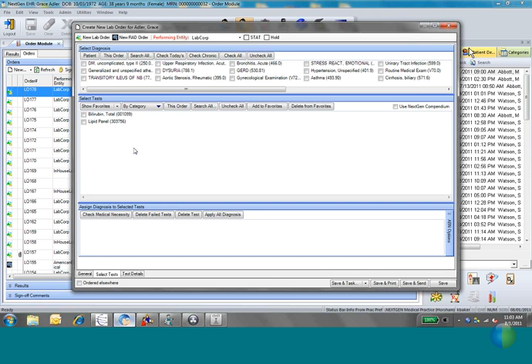So when we get into that file maintenance piece, it's directly going to affect any orders that you're going to create. There is still some setup that needs to be done if you're going to be results only, but the majority of it is on the ordering side.